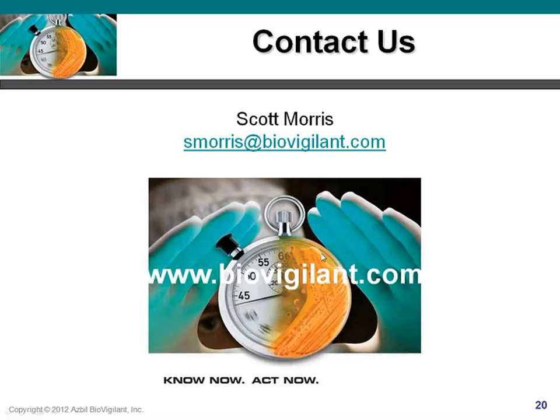So if you want to do an identification, you would need to use either a traditional technique, or there are some rapid micromethods out there now that are commonly used for identification. And actually that's a good point to bring up because it does illustrate the value that traditional methods can still play in demonstrating environmental control. There is value in collecting a sample on an agar plate, and if you're able to grow it, you're able to subculture and identify it. And so that's an important piece of information when trying to diagnose the root cause of any sort of excursion you may have in your environment. But the IMDA system itself is not able to identify.